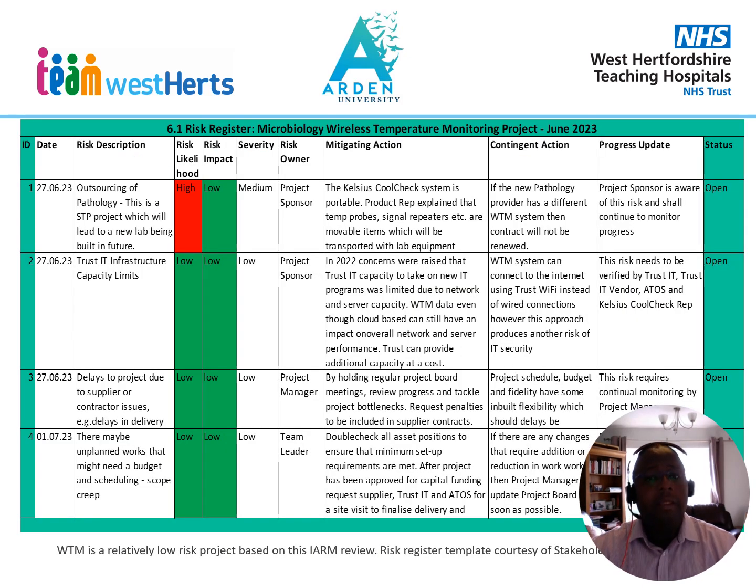So as a result of this work, I came up with 4 risks that are associated with this project. The first one is the outsourcing of pathology. This is a sustainability and transformation project which will lead to a new laboratory being built in the future as a result of the merger of, or the outsourcing of pathology services at West Hertfordshire, Princess Alexandra, East and North Hertfordshire.